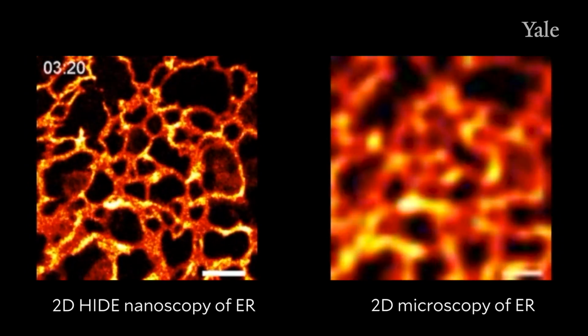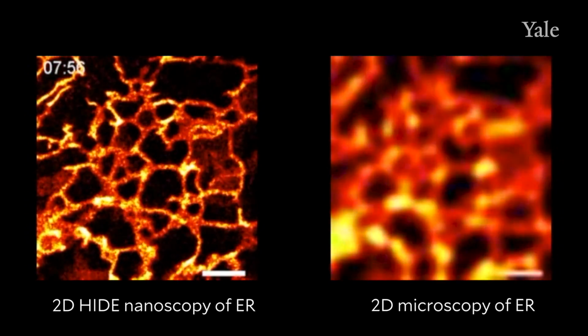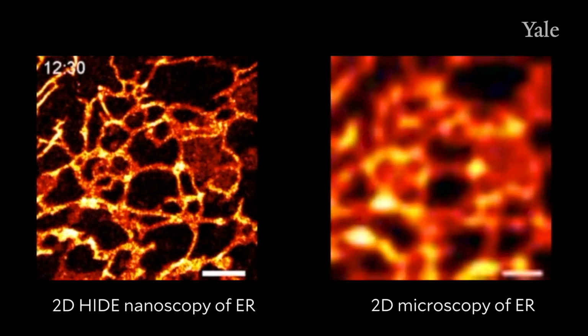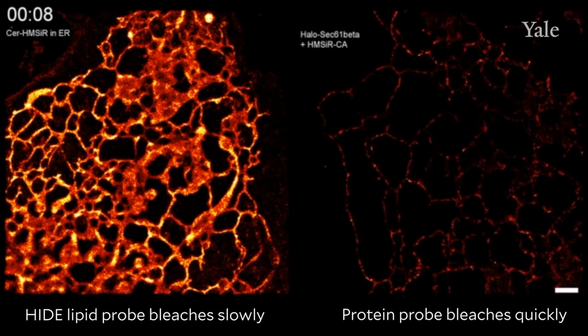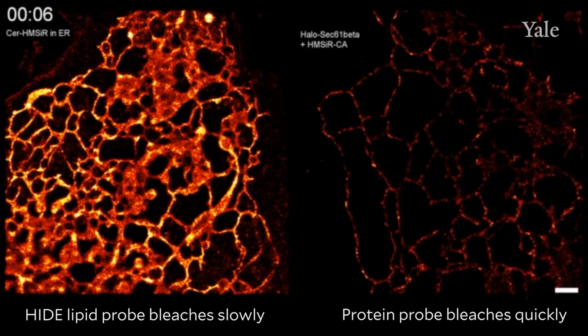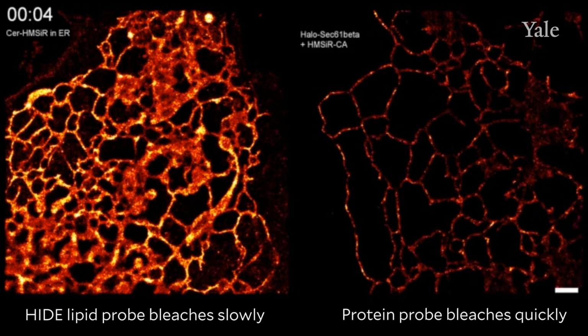Cells are incredibly complex, and to help unlock the inner workings and the mystery of life and how cells go awry in diseases such as diabetes and cancer, we need to understand and see cells at very high resolution. In the last few years, there's been this wave of new advances in these super resolution microscopes where now we can see cells at the nanoscale. However, there's a really big problem, and that is typically we can only see these cells for just a few seconds before the dye photobleaches away.